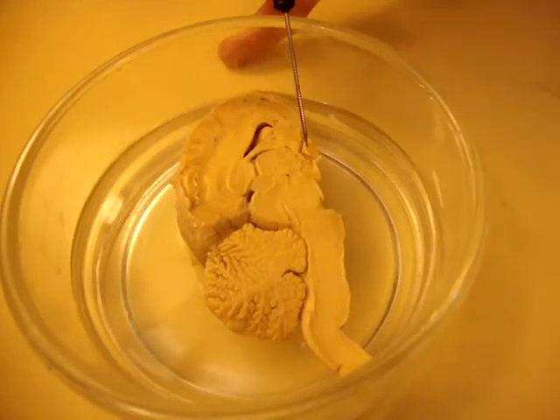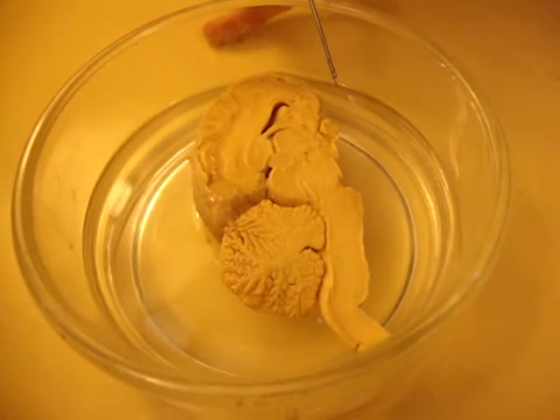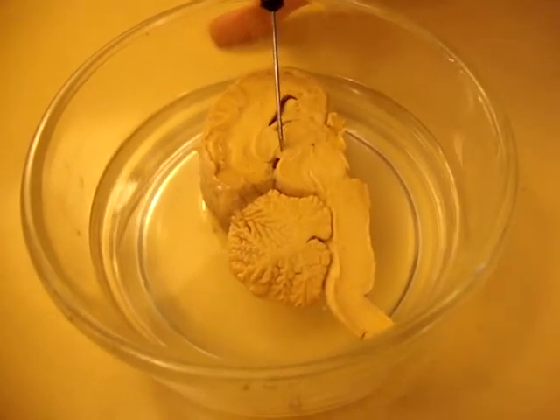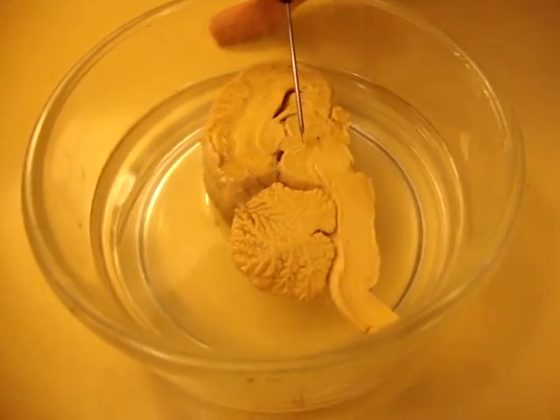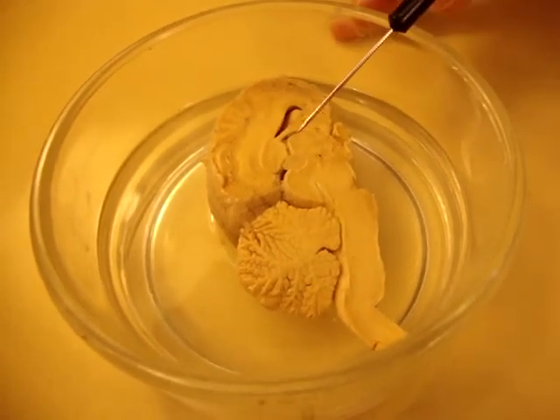Now we're into the diencephalon. And then this is the pineal gland here, the pineal body. The third ventricle is this guy right here.